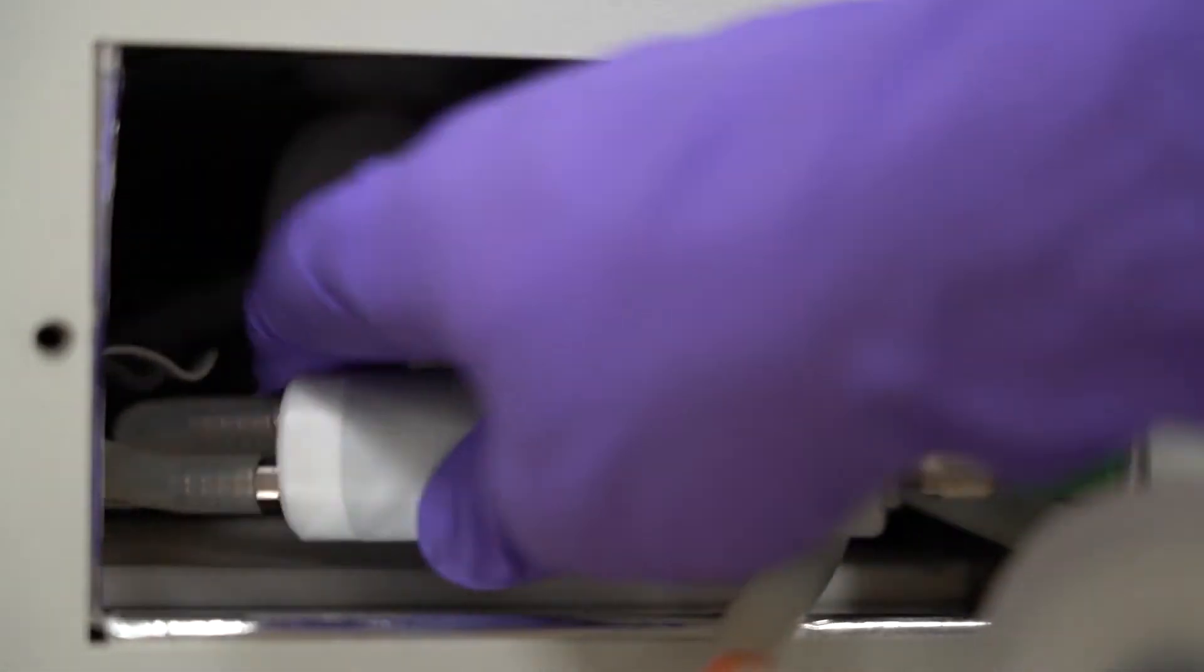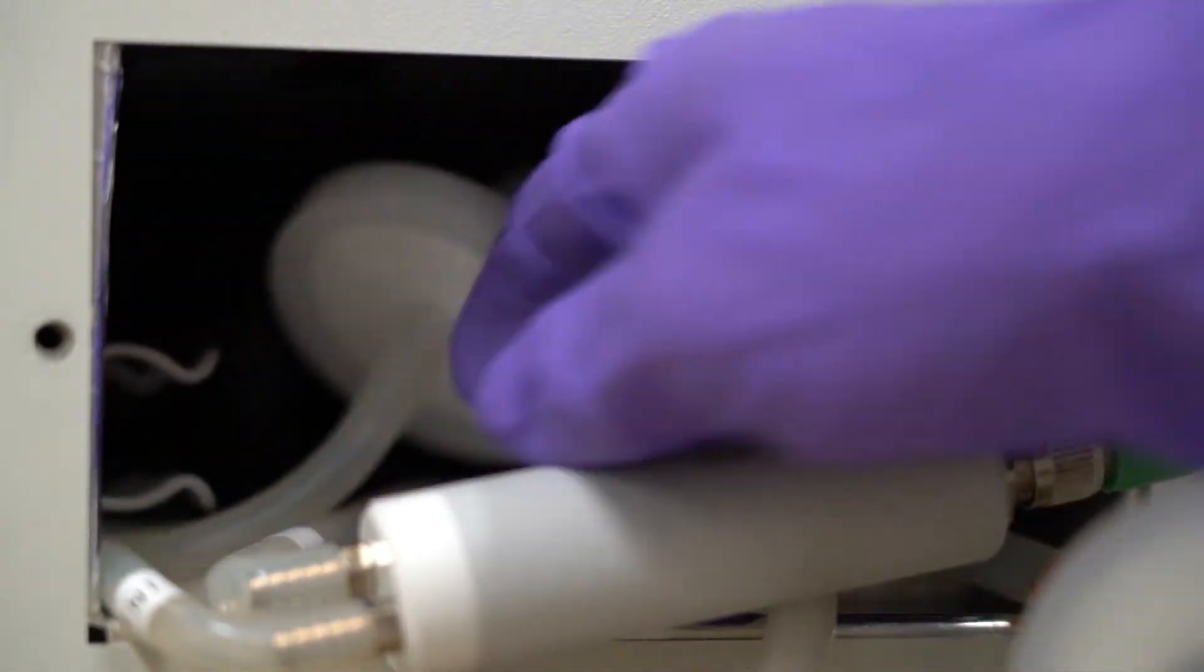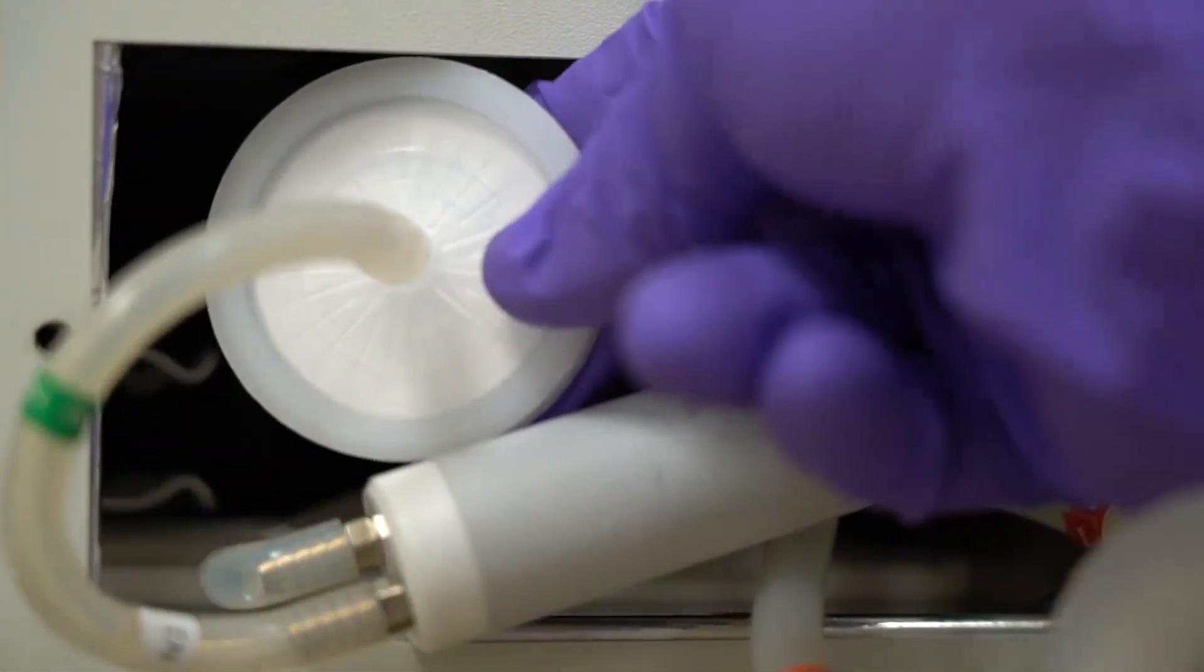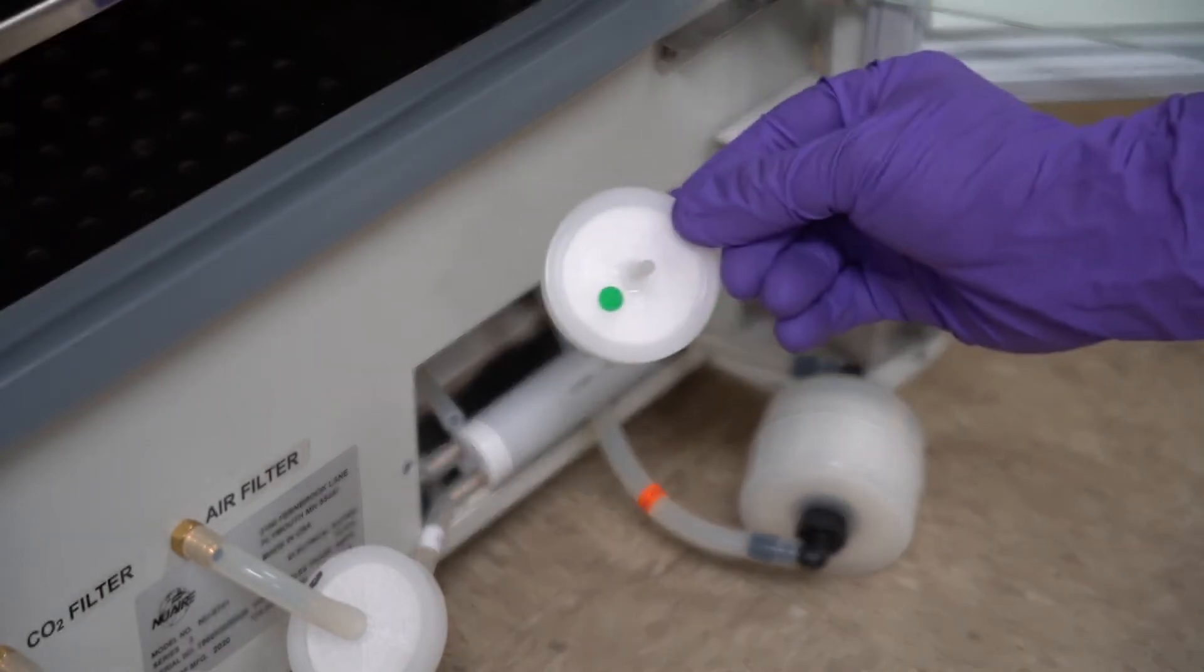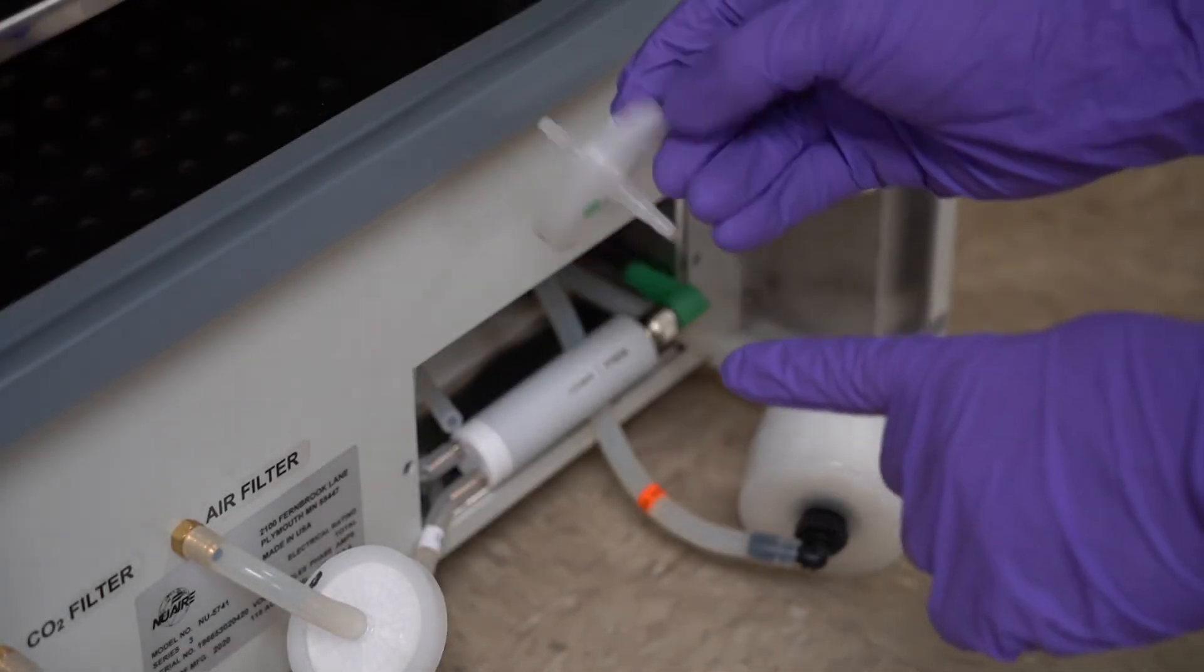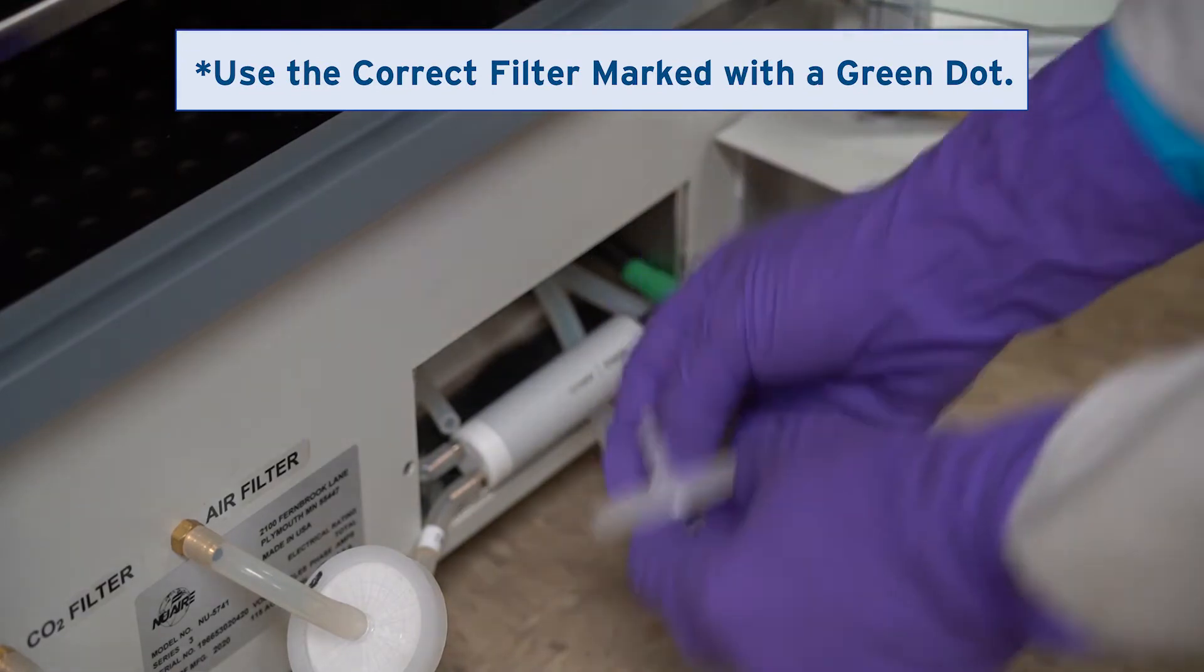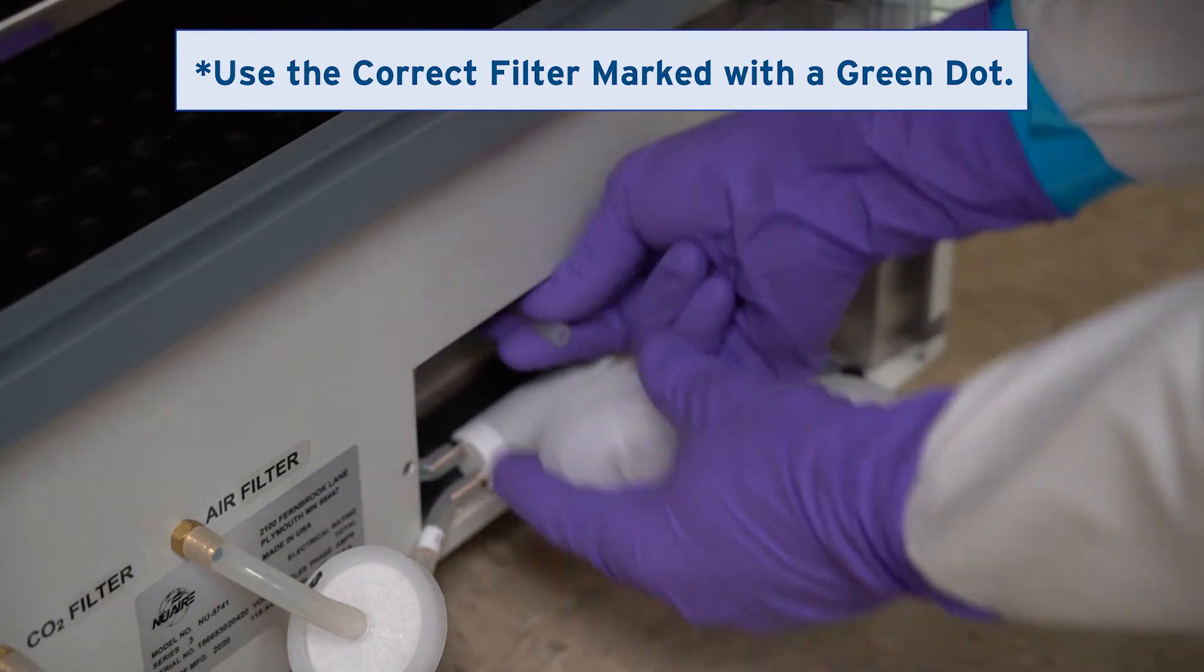Inspect the CO2 sensor disc filter and change it as needed. If necessary, remove the old filter from the tubing and connect a new one. Be sure to install the correct disc filter marked with the green dot and connect it with the correct orientation.